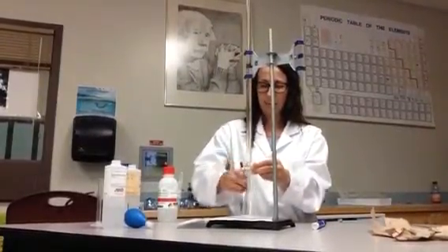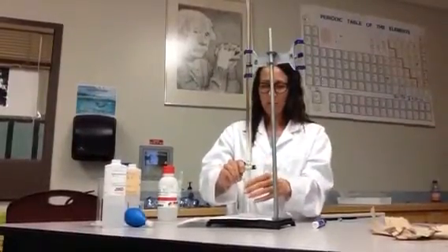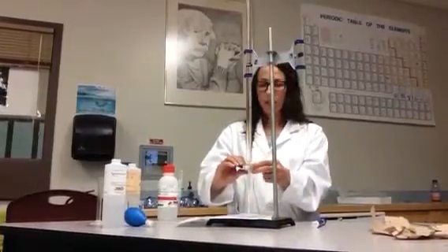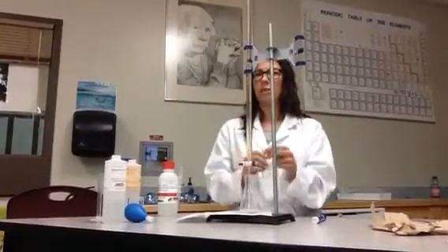This is a little stiff. Okay, there we go. So you can see it turns pink. Did you see that? Yeah. Why is it pink right there, but then it disappears? Gets neutralized. I forgot to take the initial volume.